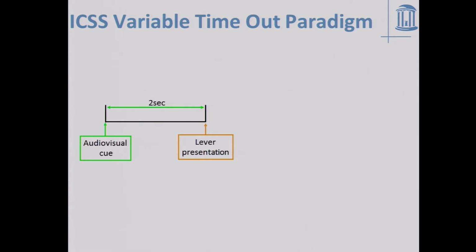This is an experiment known as intracranial self-stimulation. It's the same one that was talked about this morning with the dopamine study, except we have this extra part right here of this cue that predicts lever availability. So when the animal goes and presses the lever, some arbitrary time after the lever was available, you get the electrical stimulation, okay? The electrical stimulation you already know causes dopamine release. I've shown you that. But what is of interest here is what happens when we present this cue.